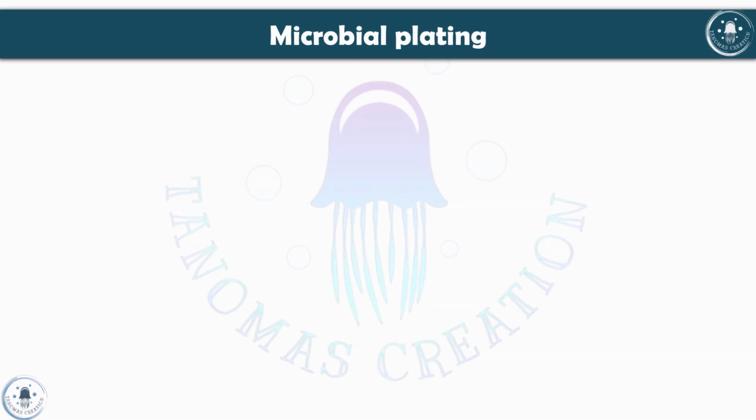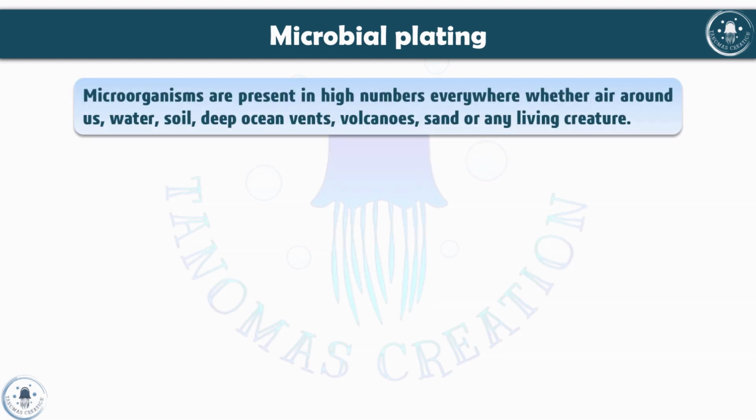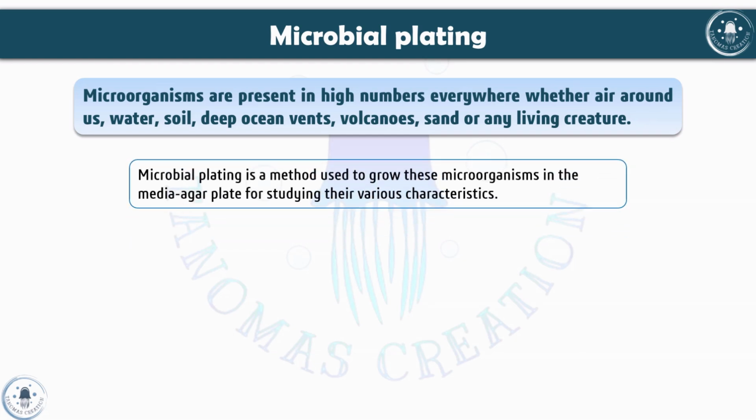What is microbial plating? Before diving into that, we need to know that microorganisms are present everywhere. Right? They're present in high numbers everywhere, whether it's air or water, soil, deep ocean vents, volcanoes, sand, or any living creature. Okay, they are present everywhere, also in high numbers.